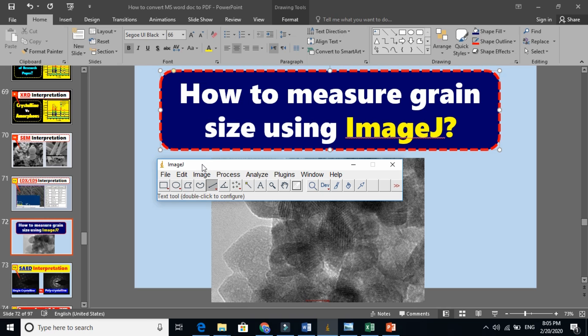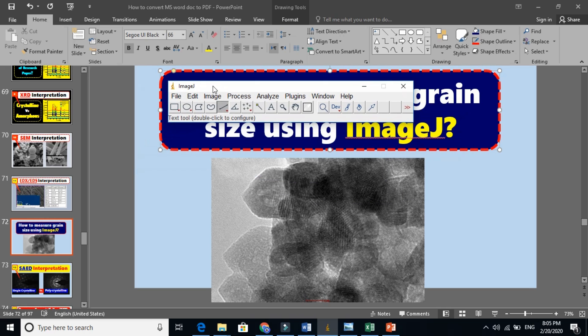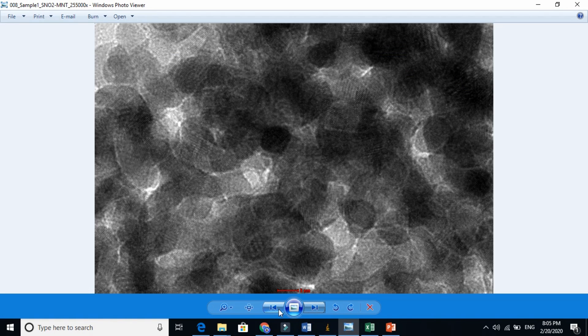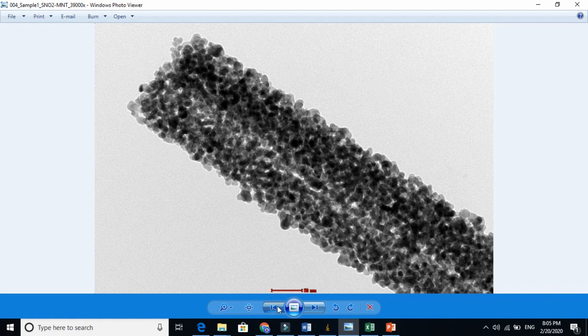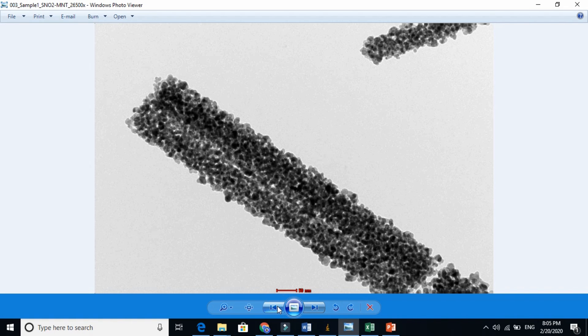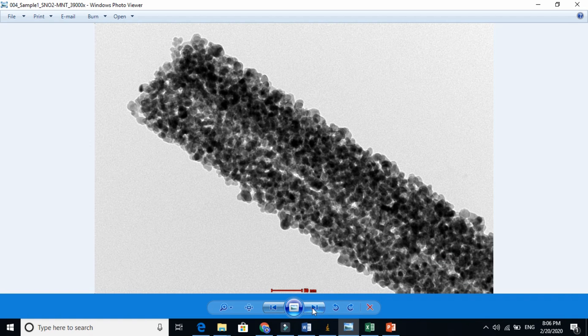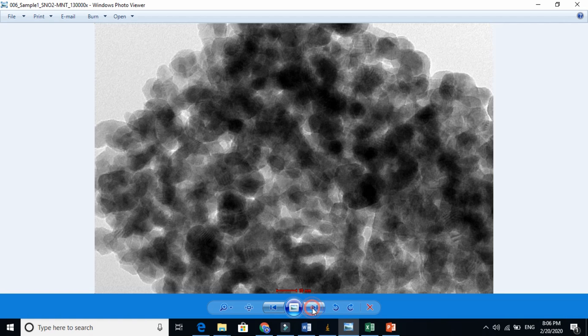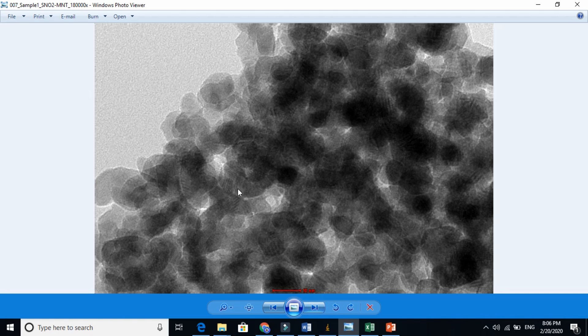This is a very basic software. For example, this is an image with me here, and this is a nanotube. When you zoom it here, you will see you will have grain size here. Now we are going to find the grain size of this material.